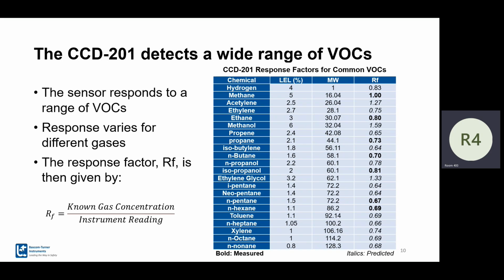If you look at what most of them are doing right now, Thermo basically, for their 2020, didn't go back and do anything. It just said, refer to the 1000B or the 108, which is what that was.